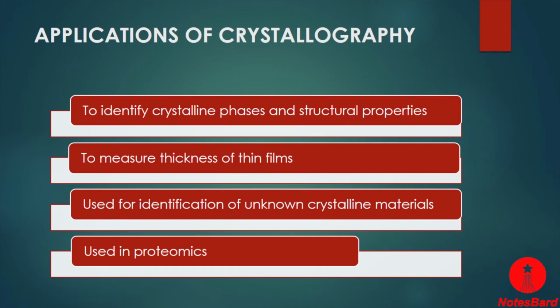So these are some significances and importance of the crystallography method. Besides these, there are several limitations of X-ray crystallography also. The most concerning limitation is that it is a most difficult method to crystallize any material.